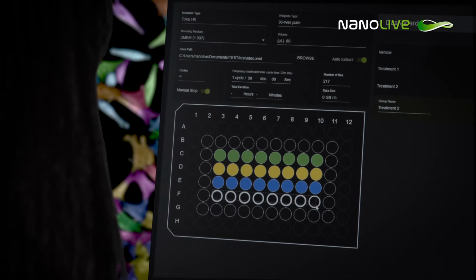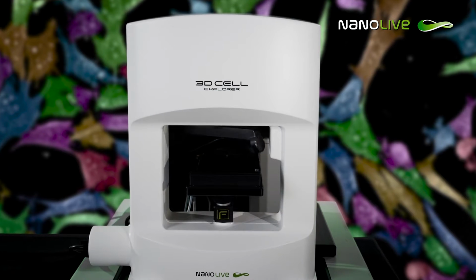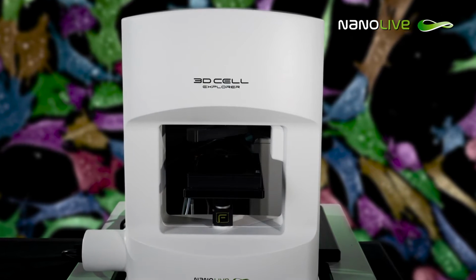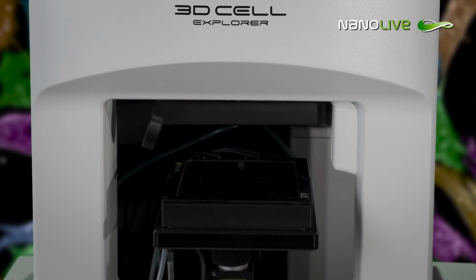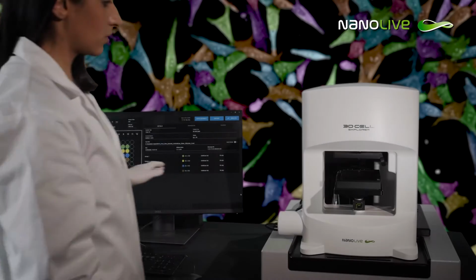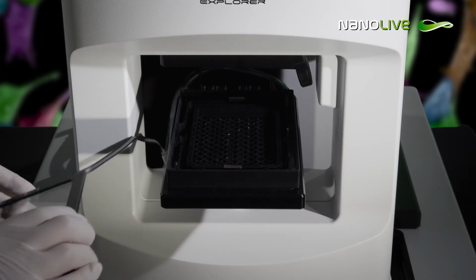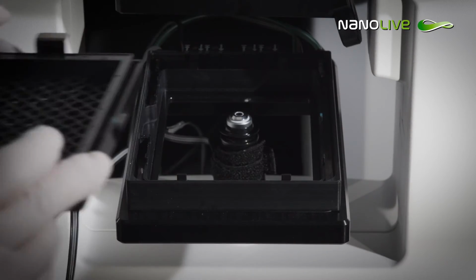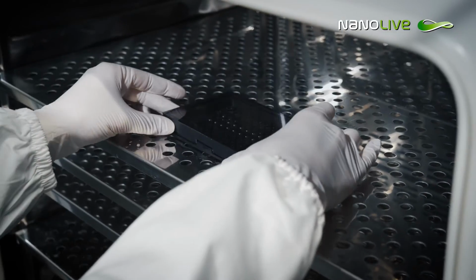Let Eve Analytics' user-friendly interface guide you through your experimental setup and then walk away. The CXA will ensure that your images are acquired while your cells are safe and healthy for as long as you need inside Nanolive's integrated top-stage incubation solution. Once imaging is finished, easily collect your cells from the CXA's accessible sample stage and move them back into your incubator or proceed to run your downstream experiments.